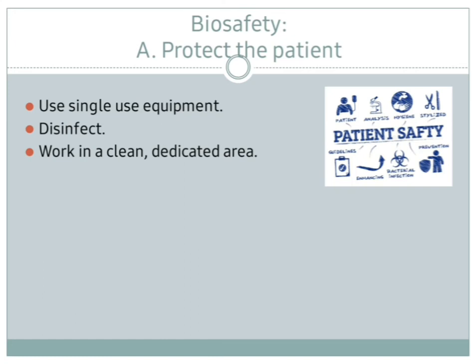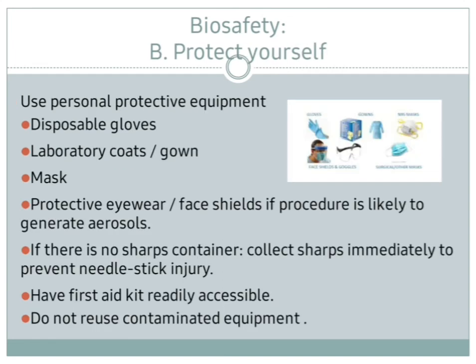Disinfect and work in a clean and dedicated area. Now protecting ourselves, we have to wear protective equipment like gloves, gown, mask, protective eyewear and face shields if the procedure may produce aerosols. If there is no sharps container, we have to collect the sharps immediately to prevent needle stick injury. Also, we have to have a first aid kit that is readily accessible and not reuse contaminated equipment. These steps are very necessary to protect ourselves.